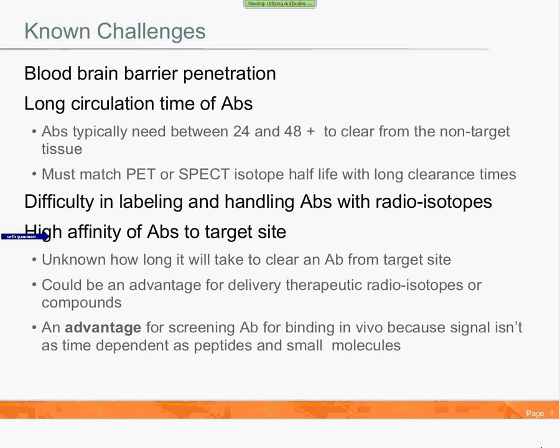Certainly, if there's some enzyme in the body that's chemically degrading your fluorophore, or degrading the antibody and therefore degrading the fluorophore, there is a half-life associated. But the lights essentially aren't going out on a fluorophore in vivo unless it's being chemically degraded.